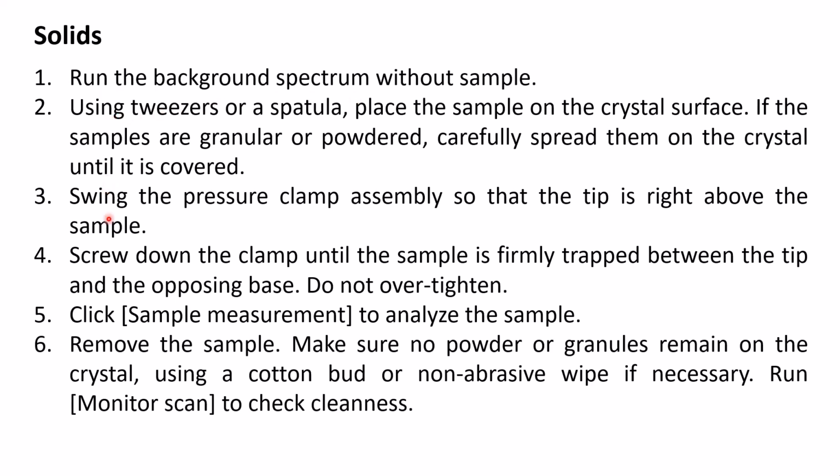Just as we've talked about, you prepare your solid sample, whether you use the potassium bromide pellet approach, the Nujol approach, or you just mix it with DCM, whichever way you prepare it, you also run that, and then you get your spectrum.